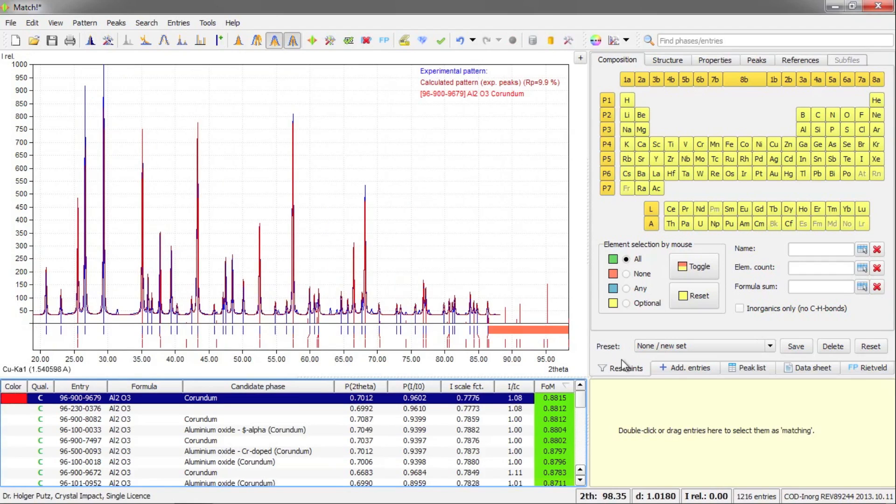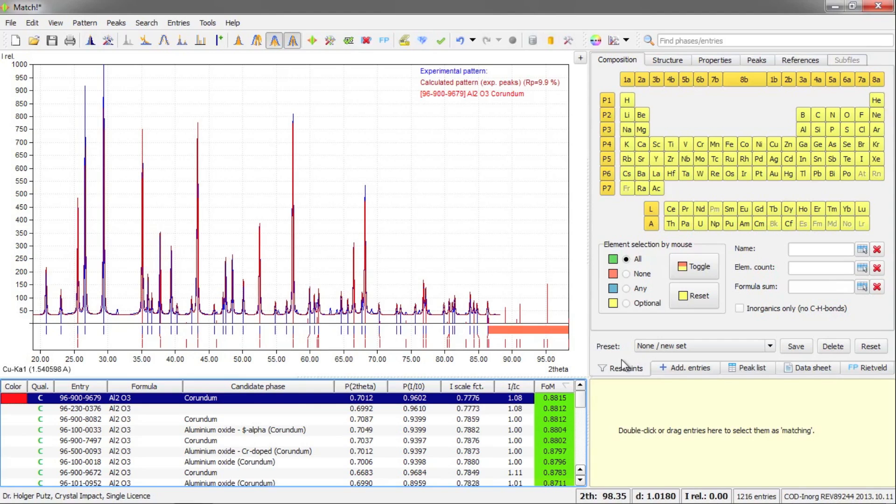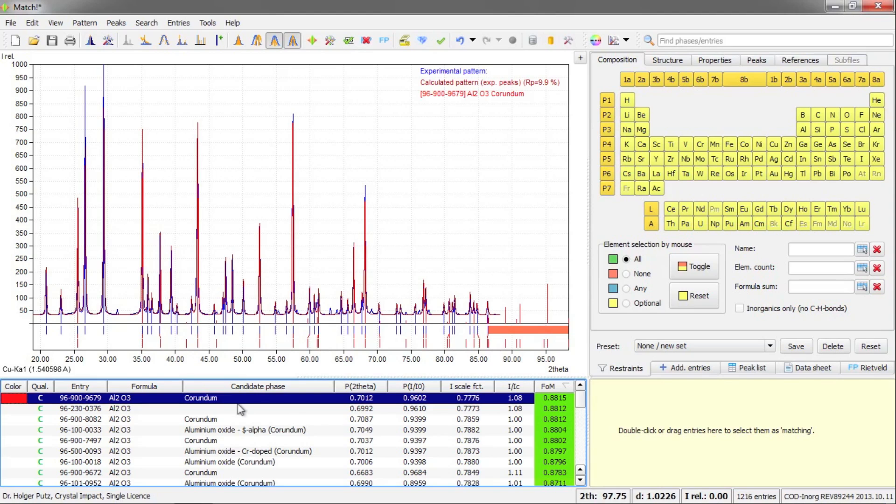And now you see the diffraction data are imported automatically, the peaks are determined automatically, and the phase identification procedure has already been run. That is the search match calculation. And on the left hand side here at the bottom, you are already presented a list of potential phases that might be present in your sample.